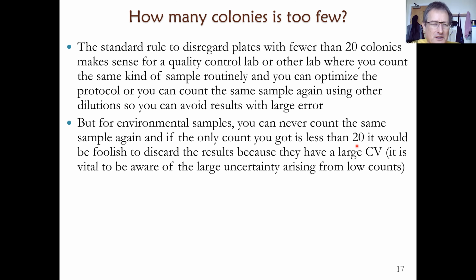Okay, here's an example of how it's generally done. A simple example, obviously. You plated out 0.1 milliliter aliquots of a 1 to 10 dilution and a 1 to 100 dilution of a particular culture on 2 plates each. The results are 200 and 180 colonies, and 22 and 16 colonies on the higher dilution.